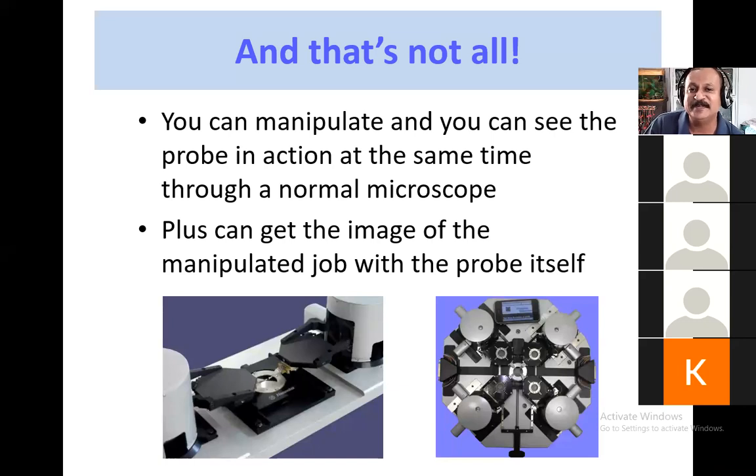And if it is not very interesting, then I will tell you another interesting fact. Not only can you observe a surface using the atomic force microscope, but you can also carry out certain kinds of manipulations. Like in the case of the IBM logo, I have told you that 35 atoms of xenon were collected, placed on the surface, and arranged in the form of the letters. That was imaged by the scanning tunneling microscope, but that can also be done with the atomic force microscope.